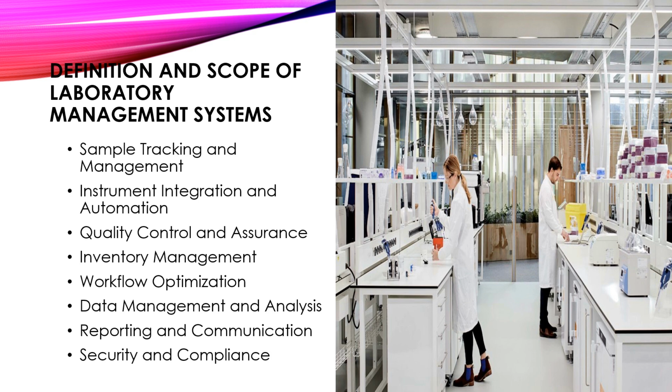Second is instrument integration and automation. Many laboratories rely on sophisticated analytical instruments and equipment for testing and analysis. Laboratory management system often integrates with these instruments to automate data capture, analysis, and reporting processes, minimizing manual errors and increasing throughput.